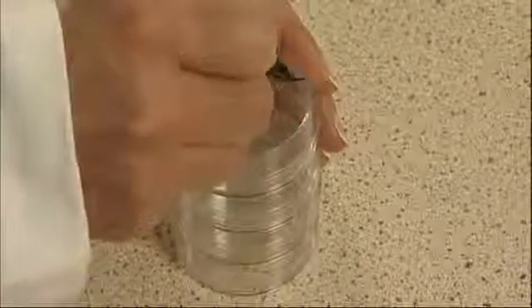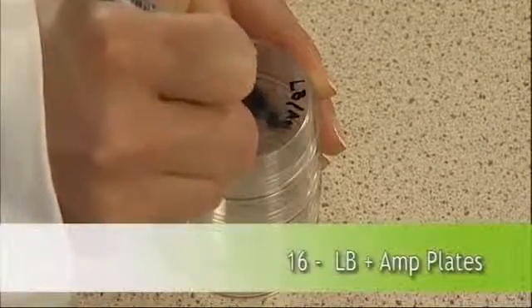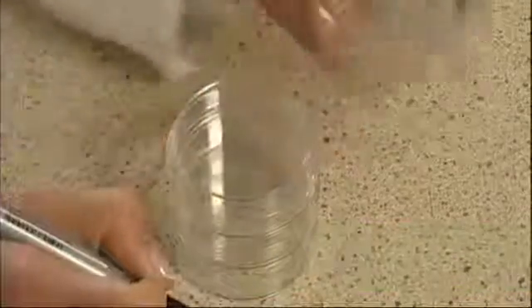Next we need to label 16 plates LB Amp. These plates contain LB agar and the antibiotic ampicillin, which is used to identify transformed bacteria.